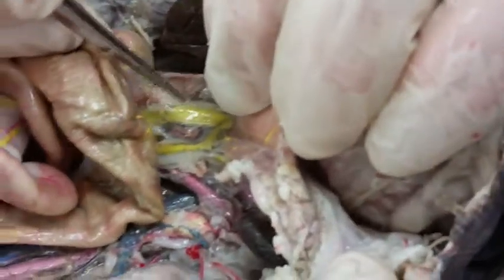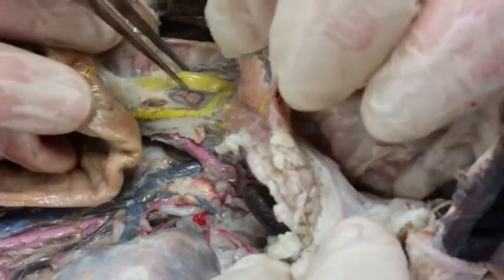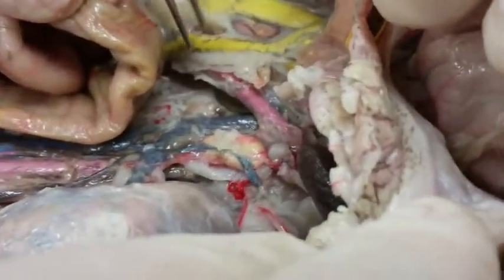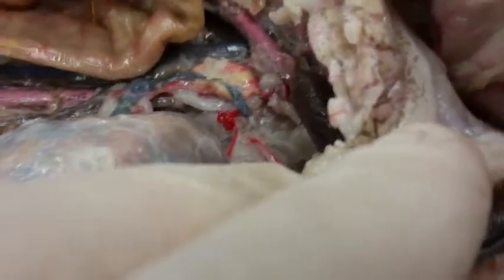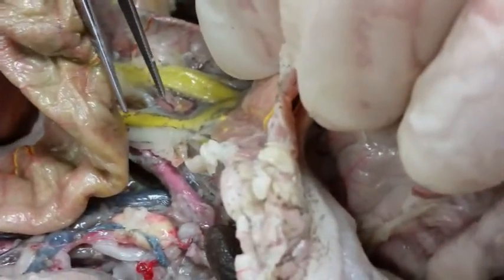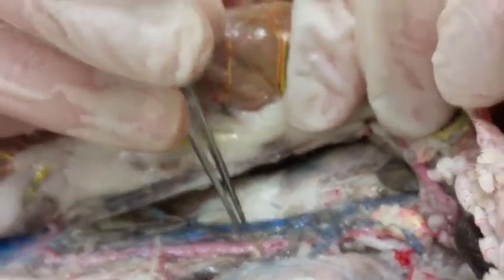One of these is going to be the gastrosplenic vein. It's going to be this one here. And then the other one is just two intestinal veins, it looks like. So you have the hepatic portal way up in here. Can't see it very well on our specimen. And then you've got gastrosplenic and intestinal veins. Or actually, mesenteric vein. No, mesenteric veins are down here. Okay.